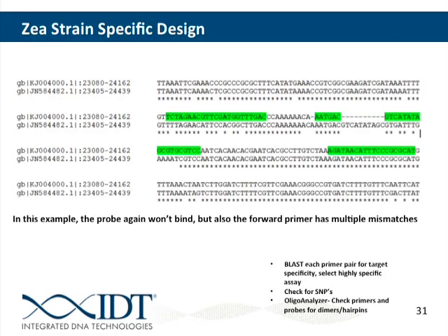And so using Clustal and PrimerQuest, we can use those alignments to tell PrimerQuest where to design assays based on our needs, whether that be species specific or strain specific or common. If you want to design an assay that's going to work for 4 or 5 different species, so you want an assay that's going to work in human, mouse, rat, and monkey or something, you can align all of those sequences, select regions that are similar, and target those with PrimerQuest.